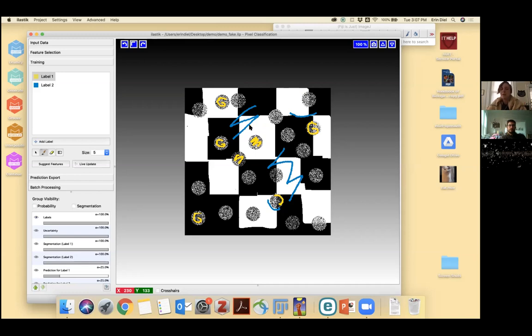So this is an example where you're not only segmenting based off a single rule, like some single threshold, but you want to take into account the context of a pixel as well. This is not only a white pixel, but it's also in the context of this mishmash of white and black pixels, whereas this white pixel is in an environment of equally bright pixels.